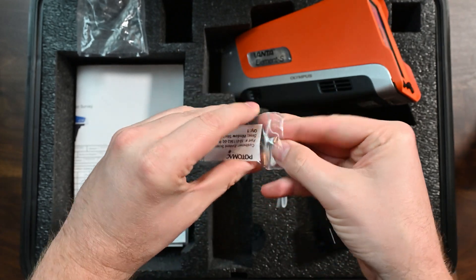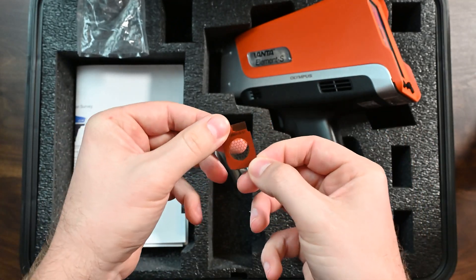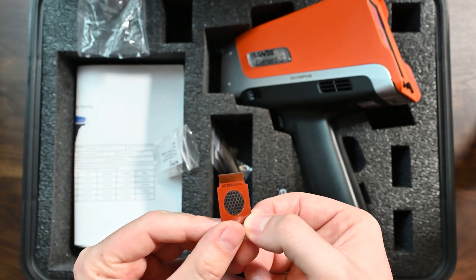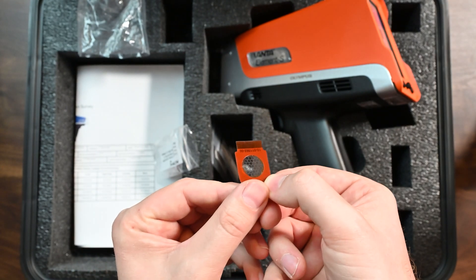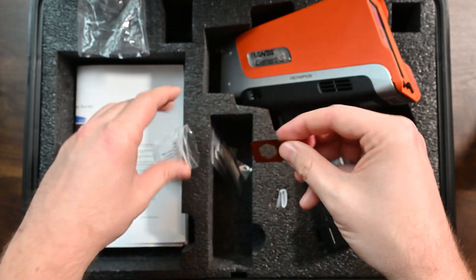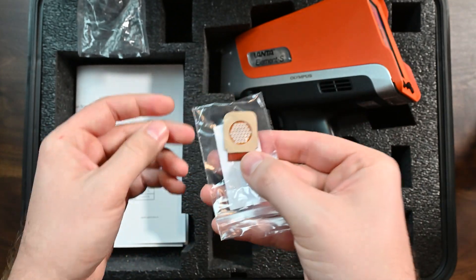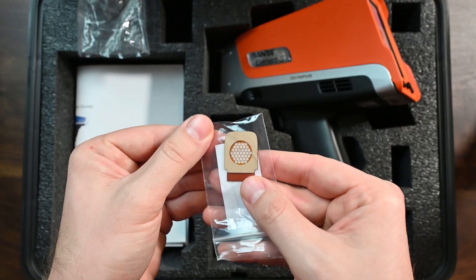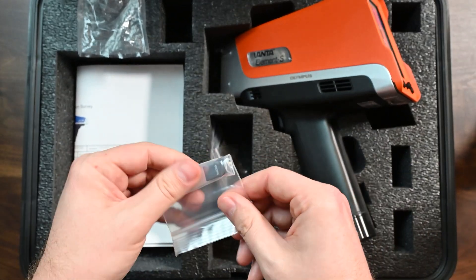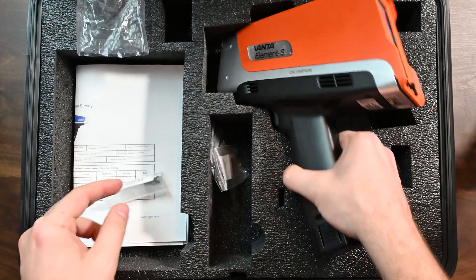Let's pull one out and take a look. You'll see that this window has a Kapton mesh with, if you can see in the light there, a little bit of a shine. There's actually probably a Prolean backing to this window — great for protection of your handheld XRF. You can see that nice gridded mesh window very clearly. You're also given a USB thumb drive, and I'll show you where that goes in just a second.